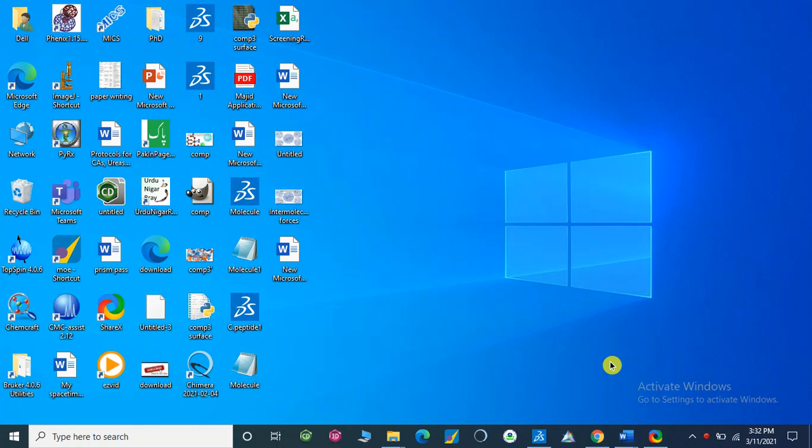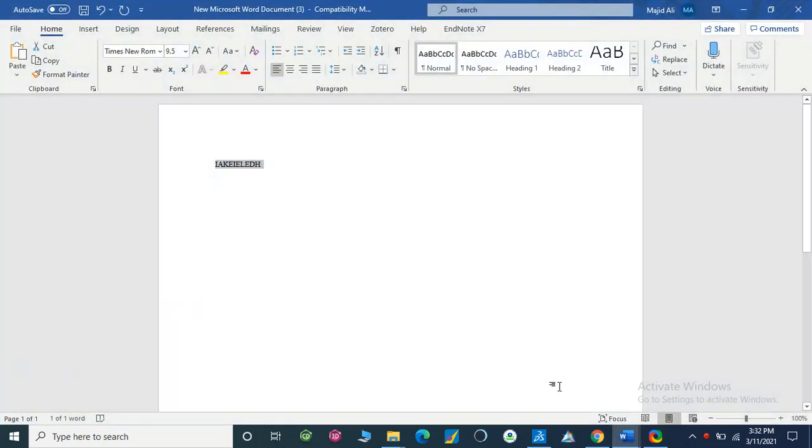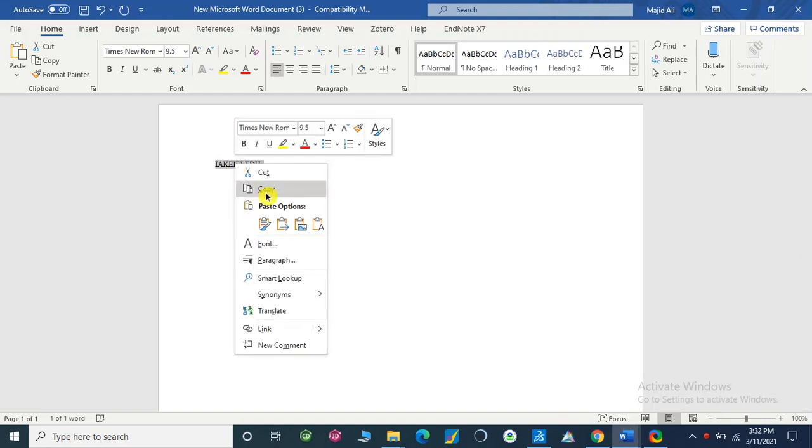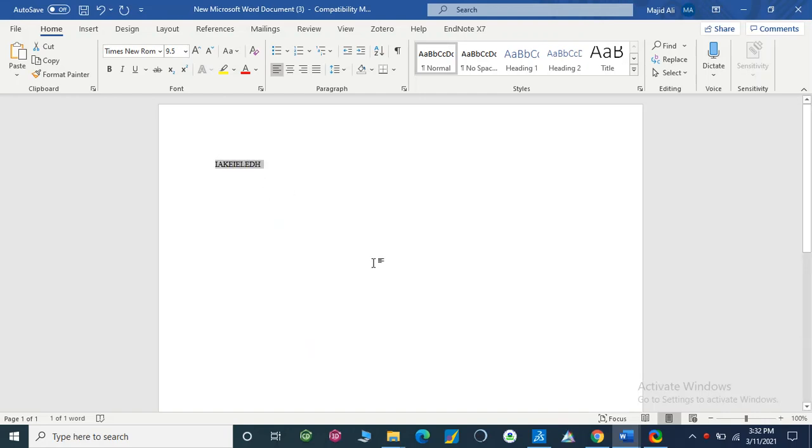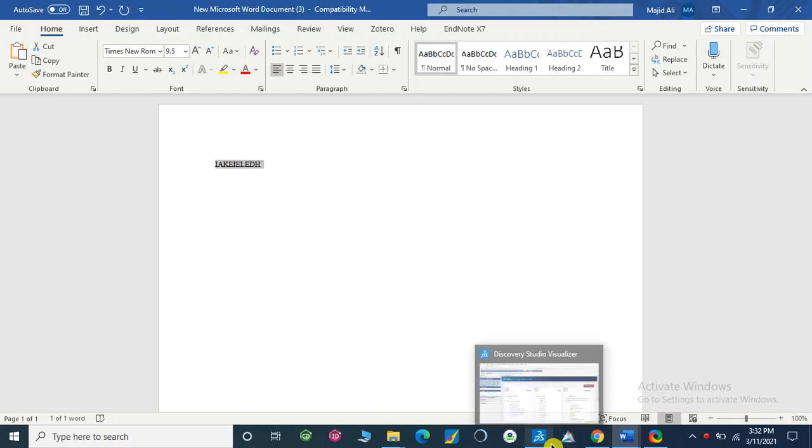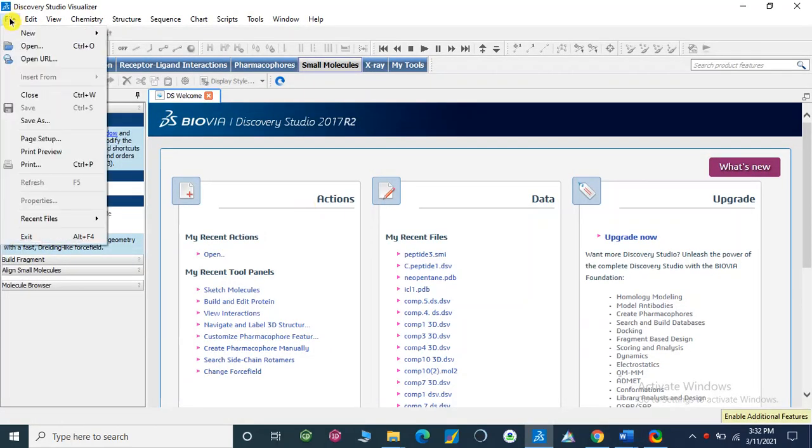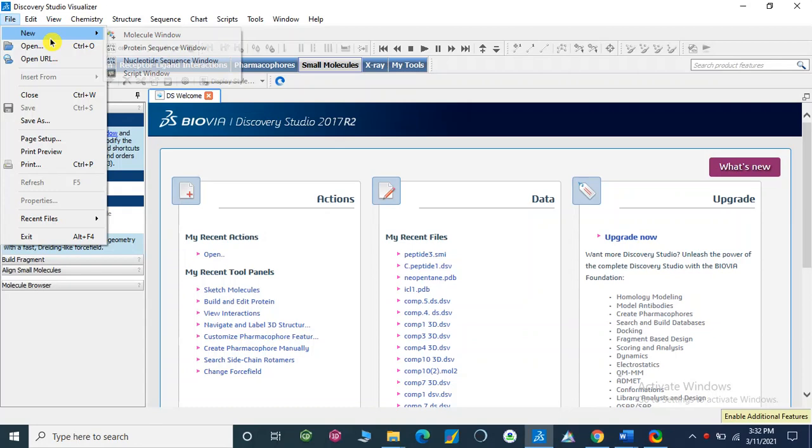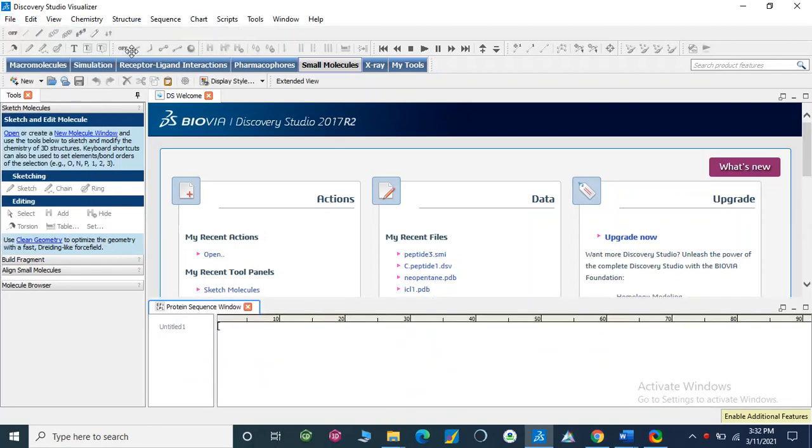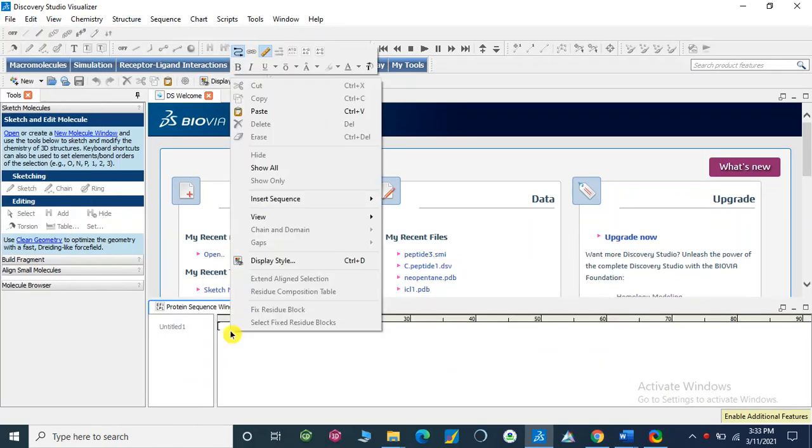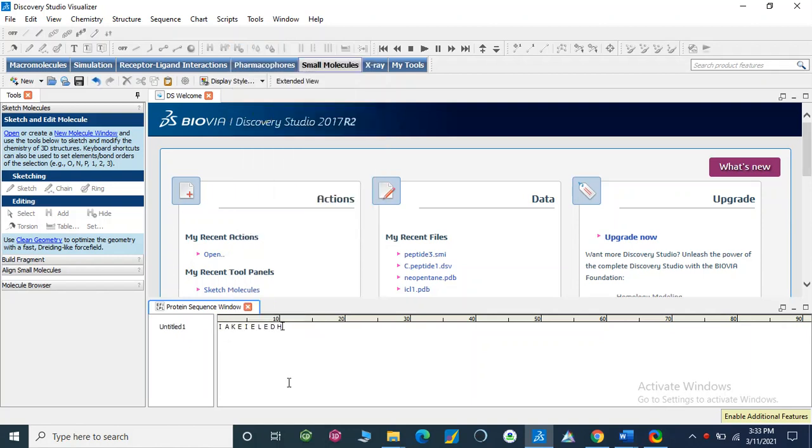Dear viewers, today I am going to show you how we can make a cyclopeptide. For this, we have a sequence of cyclopeptide, so copy it. Then here we have the Discovery Studio Visualizer. We will open a protein sequence window. Here we are going to paste this, our cyclopeptide sequence.